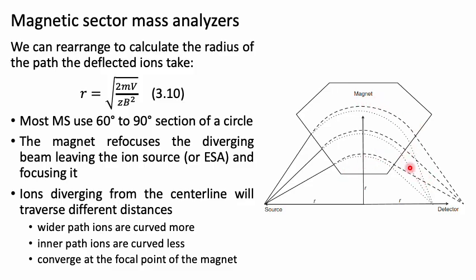And the magnetic field, not only does it distinguish between masses, but if we have the same mass traveling these 3 different paths, it takes that same mass and focuses it onto the detector. So this allows us to not lose particles that don't take a central path through the magnet. So it separates out the masses. That's part of its job. The second job is to actually focus them onto the detector.